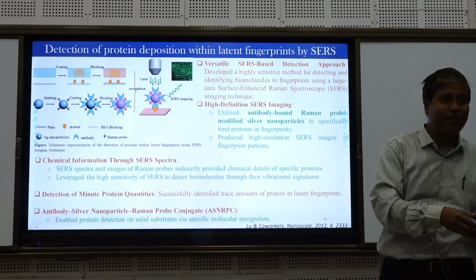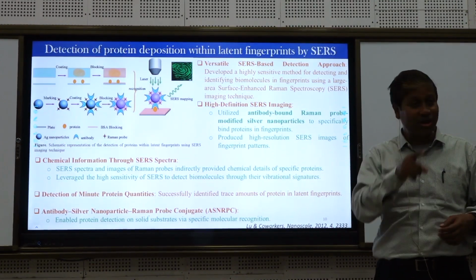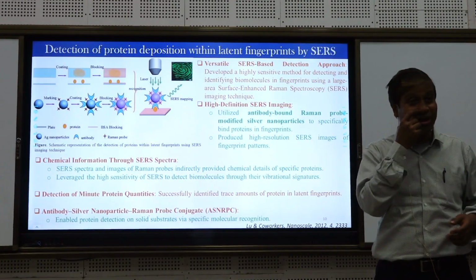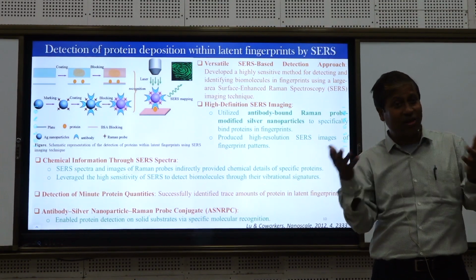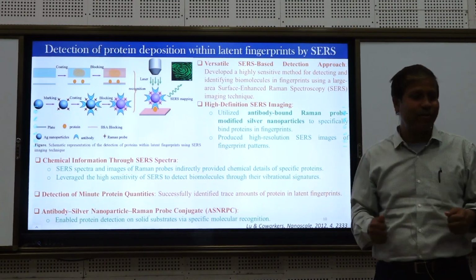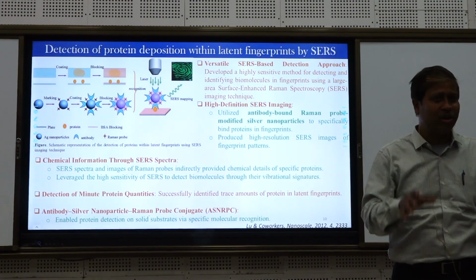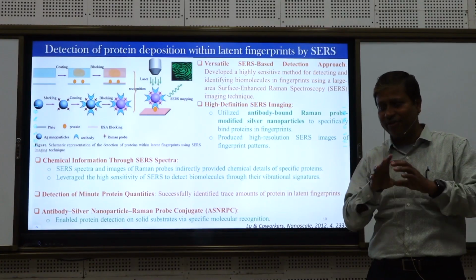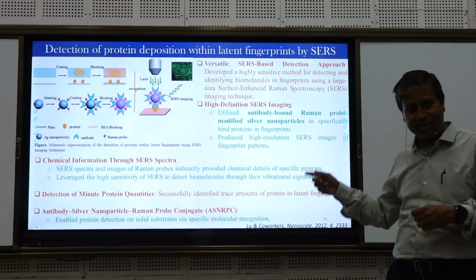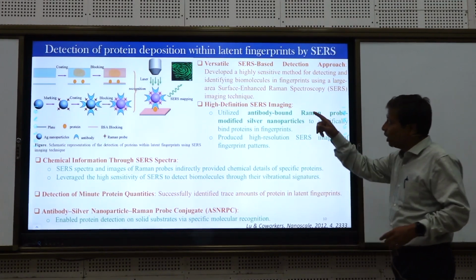But the person who had given the sample was telling, no, there is glucose in it. And finally you see he got some glucose peak, glucose, sucrose, whatever it is, that peak he got. So apparently the spectrum doesn't look different. So analysis is very important. Only thing is that we don't care about analysis. We just want to have a very clear spectrum and only then we say something. But analysis is a very important aspect in Raman spectroscopy.